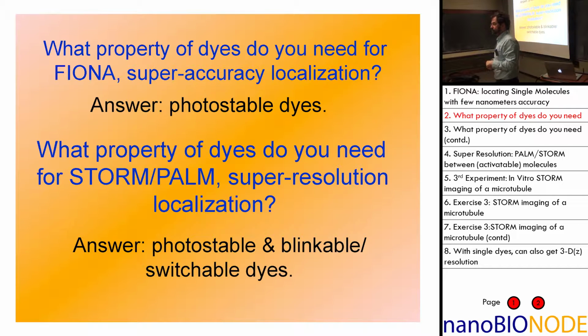Okay? So photoblinking in terms of the state of the dye, is that like some kind of triplet state? It depends. In fact, if we have the time, I'll go over it. But you can have, like GFP, green fluorescent protein, but if you make a mutant of it, it doesn't emit at all unless you shine 400 nanometer light on it. So that's one type.